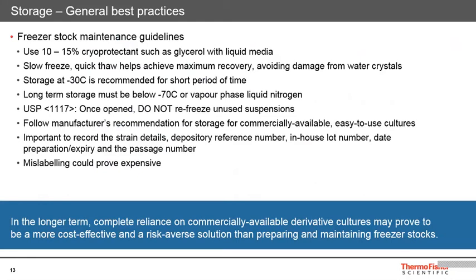We get this question all the time. Can I use glass beads? It's difficult to find a regulatory practice to support this. However, there is some guidance available from the United States Pharmacopoeia. Chapter 1117 suggests that once opened, do not refreeze any unused QC materials. If you are planning to use glass beads, when you take one bead out, the other beads would partially thaw, and repeated freeze-thaw must be avoided. Not to forget, when you're making any frozen stocks, please refer to the manufacturer's instructions.